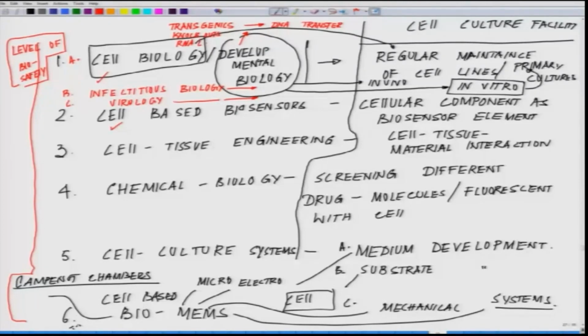So, that demands different level of precautions which has to be taken, because the very moment you are handling the DNA material or any kind of genetic material, there are certain rules and regulation or the law of the land. Wherever you go, whether you are in India, whether you are abroad, any country, every country has very, very stringent rules, extremely stringent. So, one has to know those rules and regulations a priori or much beforehand before you design.